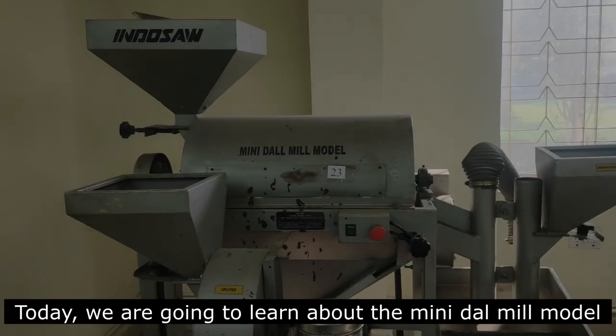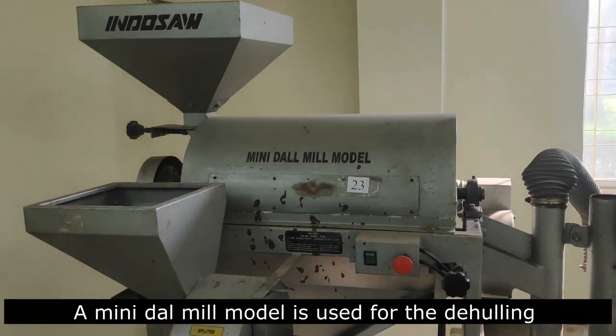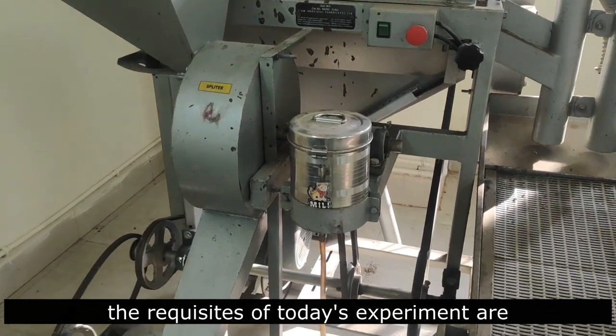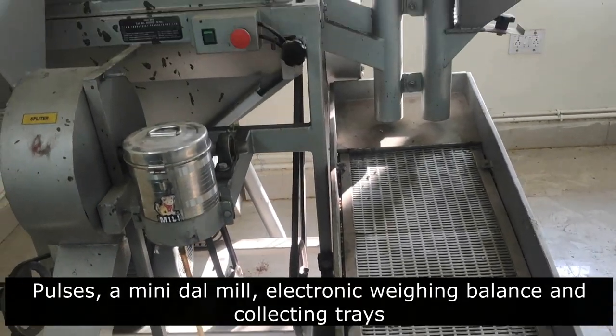Today we are going to learn about a mini-dal-mill model. A mini-dal-mill model is used for the de-hulling and splitting of pulses. The requisites of today's experiment are pulses, a mini-dal-mill, an electronic weighing balance, and collecting trays.